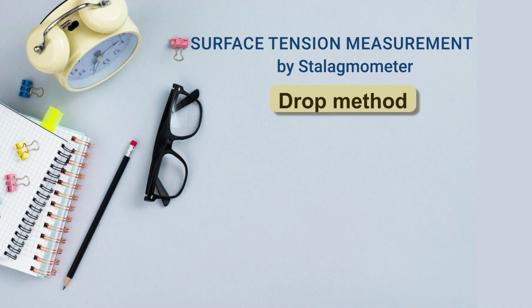You can also do it by the drop method. I had explained to you why there is tension. By tension, the top surface is stretched. That means the drop of any liquid will always be spherical. It will never spread. Suppose you put water on a tile, it will never spread unless there is a reduction of surface tension, unless the tile has a coating which reduces the tension of water. So how spherical the drop is and how big the drop is, that is the principle for measuring surface tension by the drop method.